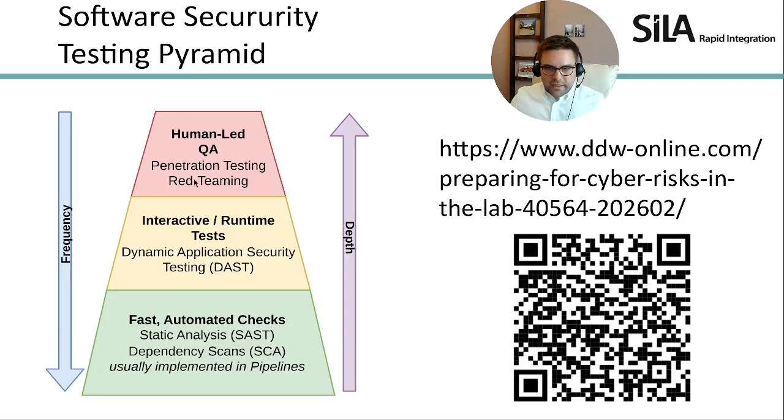And the last thing, which is expensive because it's human-led QA, you would want to make sure to only do that on top of these two. Because if you do everything by human-led QA, as it's usually done in the lab environment, that's very, very expensive, because obviously you have to do everything by hand. You have to do everything every time. So checking your software every release, checking for vulnerabilities in the third-party dependencies every day, that's an expense nobody wants to carry. There are certain things, though, you need to do manually.